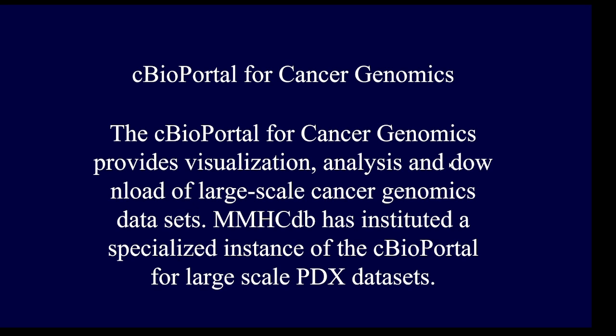Today's video is going to be a tutorial on the cBioPortal for cancer genomics. The cBioPortal for cancer genomics provides visualization, analysis, and download of large-scale cancer genomic datasets. Mouse Models of Human Cancer database has instituted a specialized instance of the cBioPortal for large-scale PDX datasets.